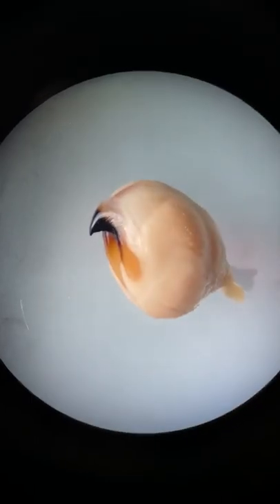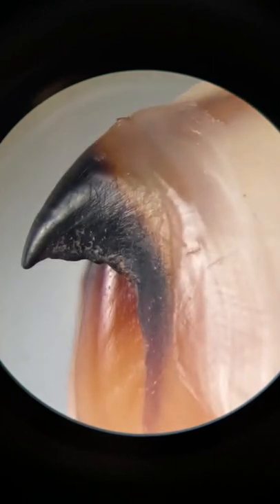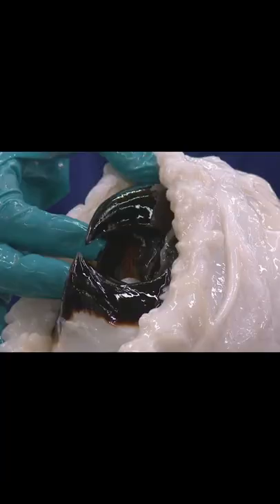When I place this ball under a stereomicroscope, I'll find something interesting. That's a parrot-like beak attached to the squid's mouth. This beak acts like the squid's jaw, and all cephalopods have beaks, even colossal squids, whose beaks are the size of grapefruits.